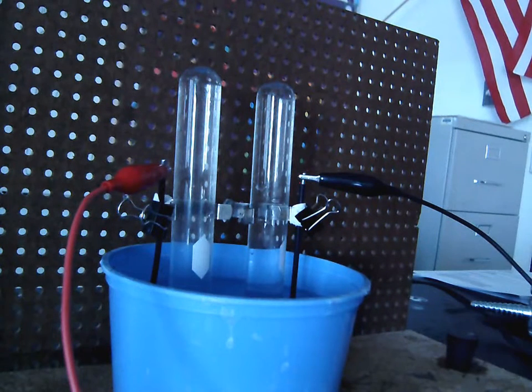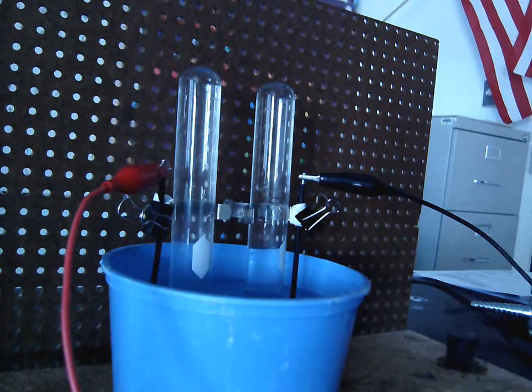One of the things that's useful with this lab is that we already know the chemical formula for water is H2O. That's something that most kids come to class already knowing, so we can call that background knowledge. When we think about decomposing water and breaking it apart into its individual components, we're thinking about breaking apart the hydrogen from the oxygen and separating them into their individual elements. So that's what we're going to be doing in this lab.